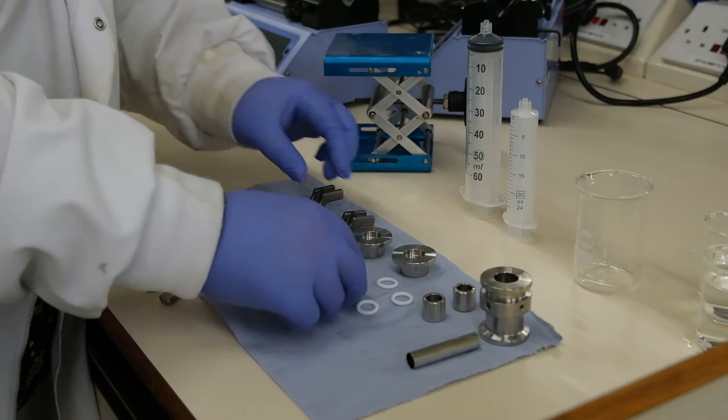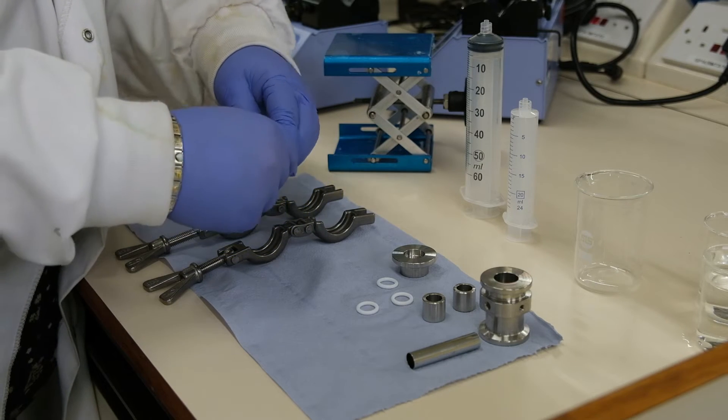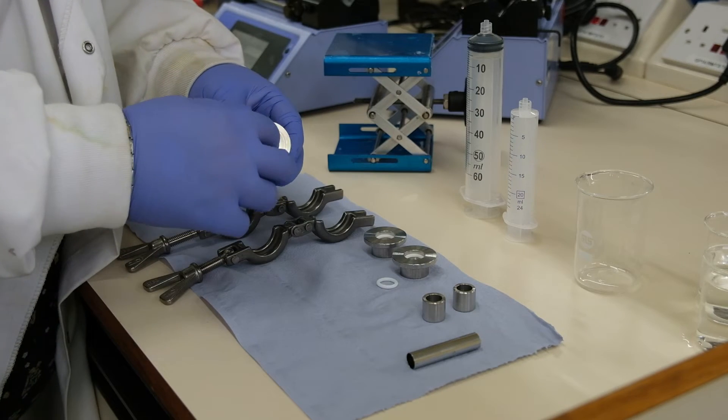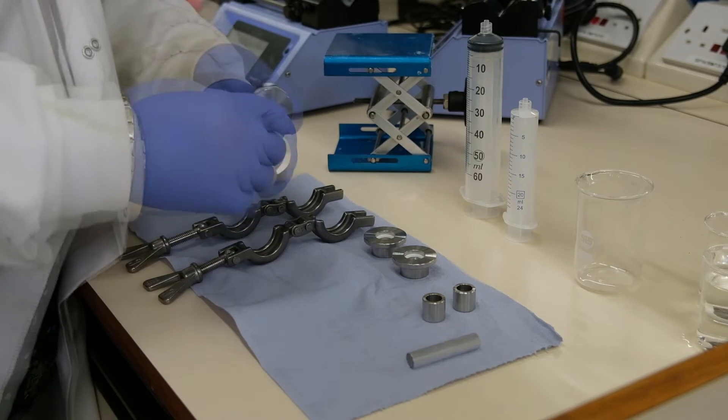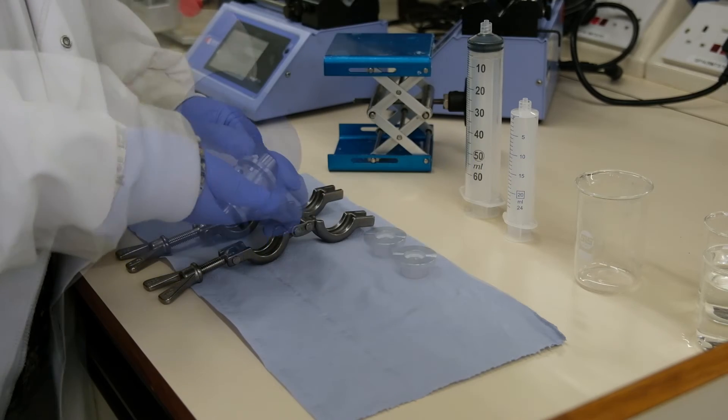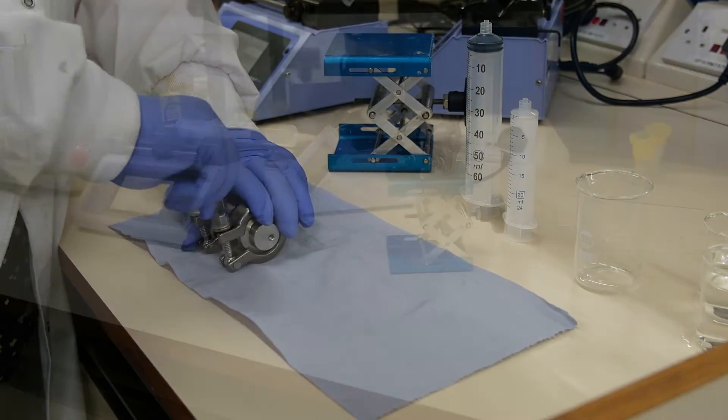All components of the AXF Mini are made from 316L stainless steel with simple PTFE seals to ensure the device is GMP compliant, offering a variety of cleaning and sterilization options. The robust construction enables repeat use while also handling a wide range of solvents, without concern for leachables and extractables.